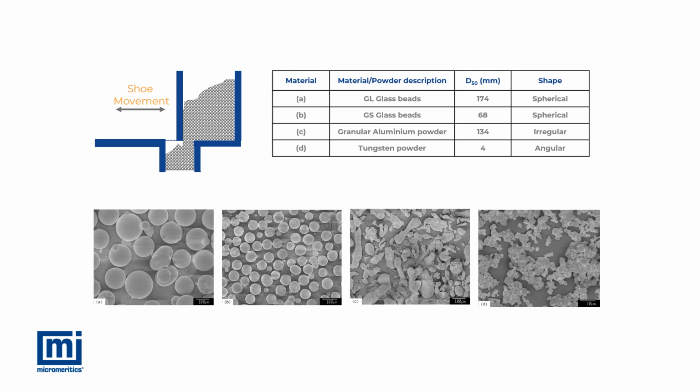For this study, 4 different powders were chosen to provide a range of different properties. 2 sizes of glass beads and 2 metal powders gave a good range of size, shape and surface texture. It should be noted that the goal here isn't to assess these powders for their suitability in die filling. Rather, the intention is to define the limits of powder properties that will work well in the process. Here, the powders are unimportant. It is the testing procedures which we hope to define.